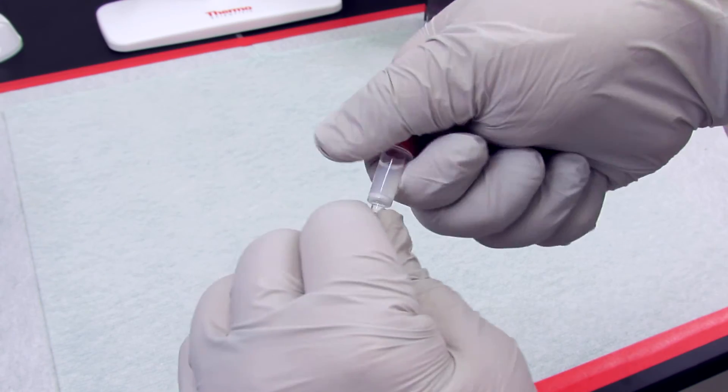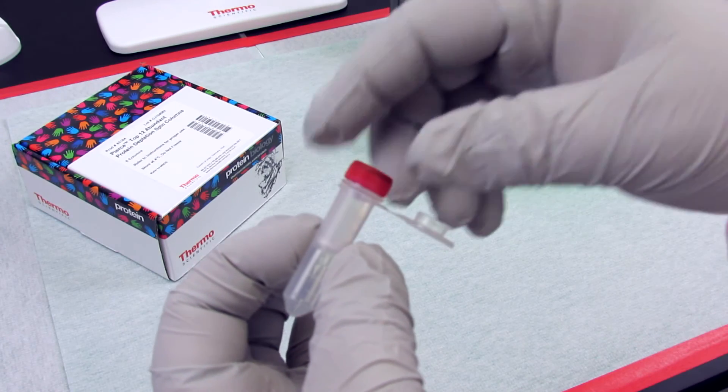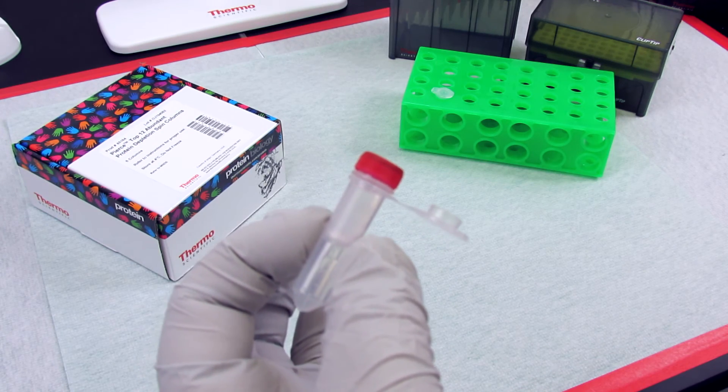Then twist off the bottom closure, loosen the cap, place the column in a 2 milliliter collection tube and centrifuge.